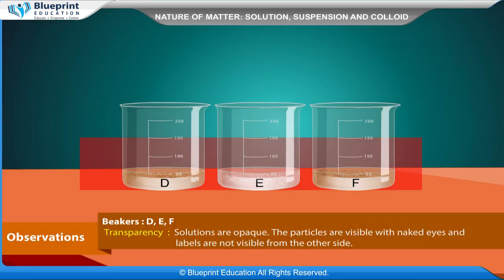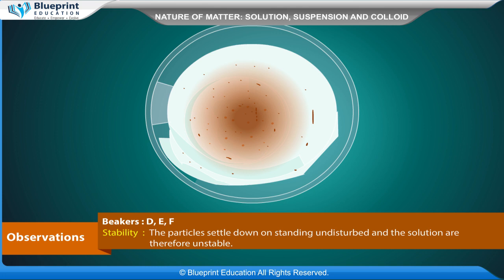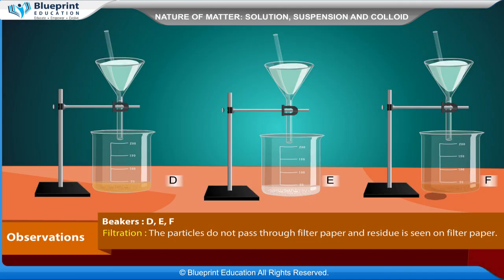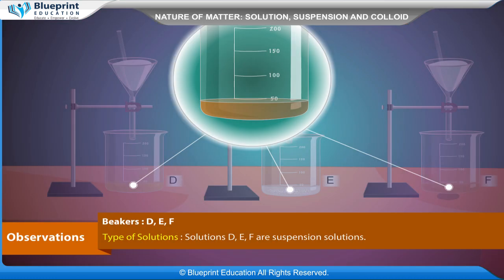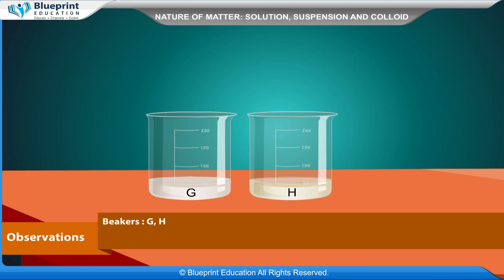Beakers D, E, F: Transparency: The solutions are opaque; particles are visible with naked eyes and labels are not visible from the other side. Stability: The particles settle down on standing undisturbed, so the solutions are unstable. Filtration: The particles do not pass through filter paper and residue is seen on filter paper. Solutions D, E, F are suspensions.